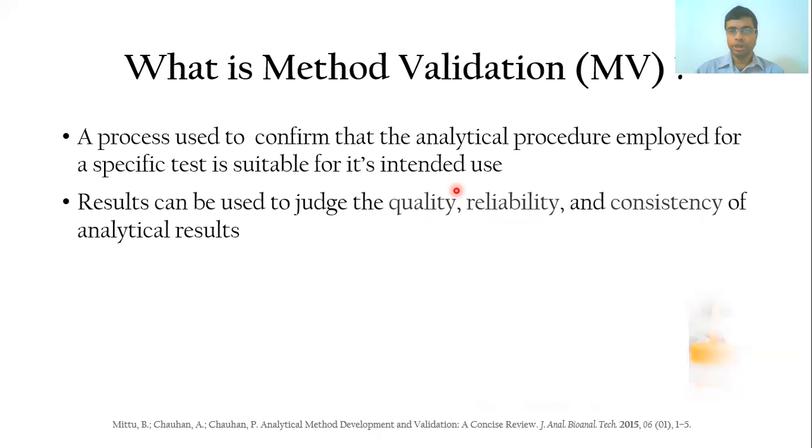It's a process used to confirm that the analytical procedure employed for a specific test is suitable for the intended use. That's very important. The results that we obtain should be able to judge the quality, reliability, and consistency of the analytical result.